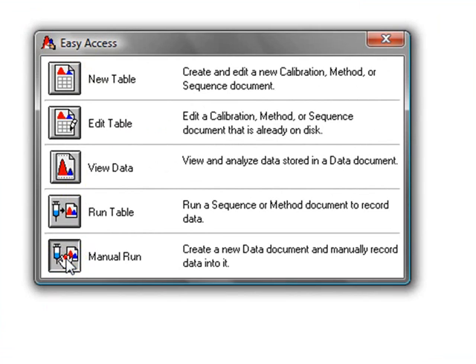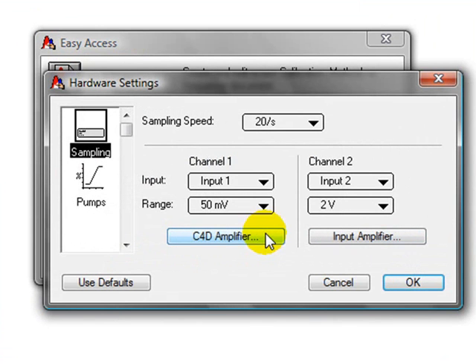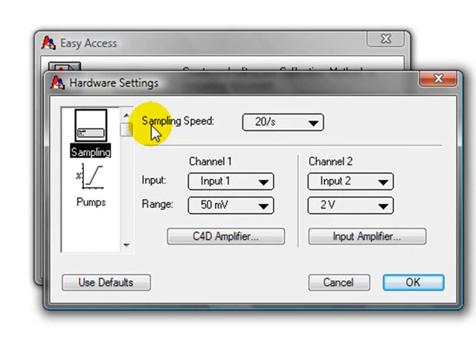You should click on Manual Run, then on Hardware Settings, and you should enter these values in the Hardware Settings window.